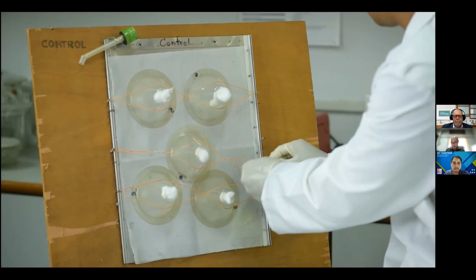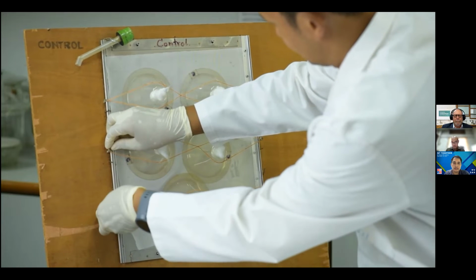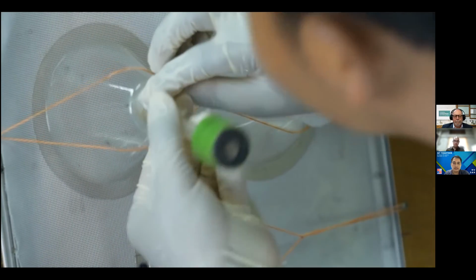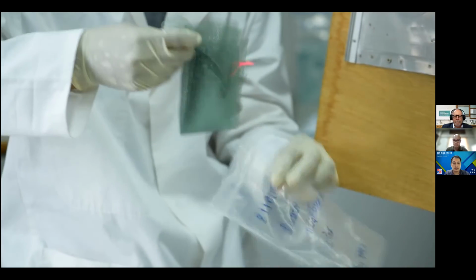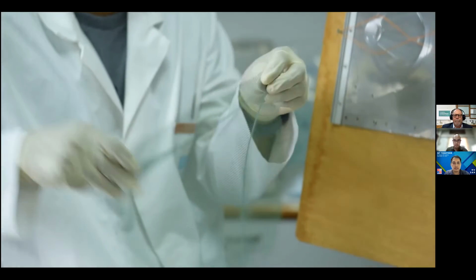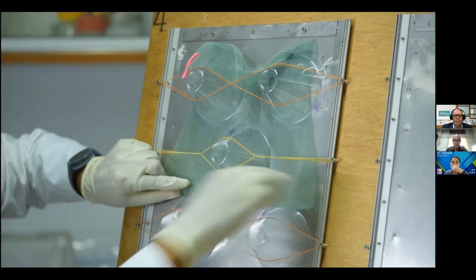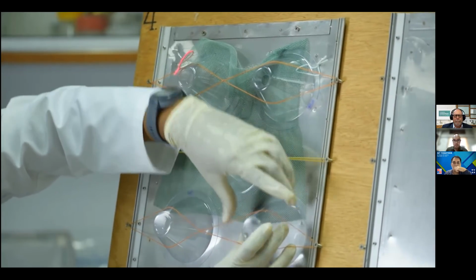WHO cone tests were originally designed to evaluate the toxicity of insecticide-treated bed nets against malaria mosquitoes. But cone tests are also perfectly suited to investigate the toxicity of other impregnated textile surfaces, such as impregnated clothes or insecticide-sprayed walls. In this video, we are going to use insecticide-treated bed nets, but the principles are exactly the same, whatever treated surface you want to test.